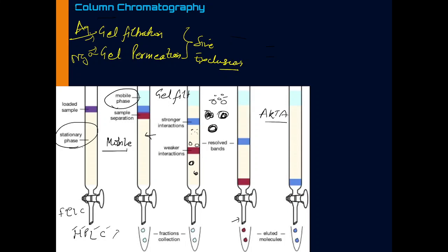In affinity chromatography people also use streptavidin-biotin, where you can conjugate your protein to biotin and then purify it. Or you have a specific tag, let's say an HA tag, with your protein, and then you can use a column which preferentially binds the HA-tagged fusion protein, and the rest of the things will be passed out with the buffer.